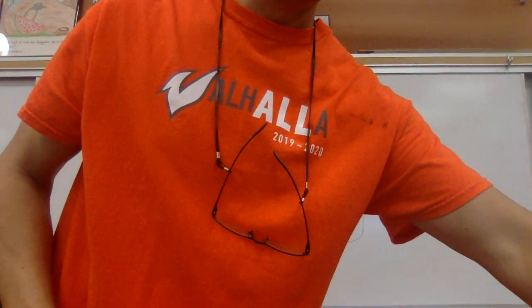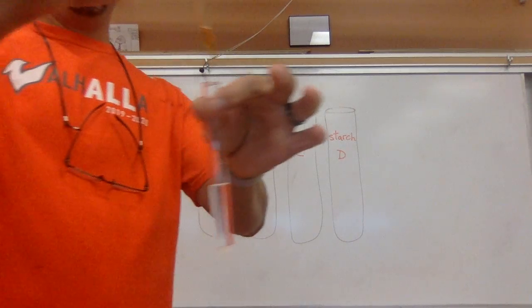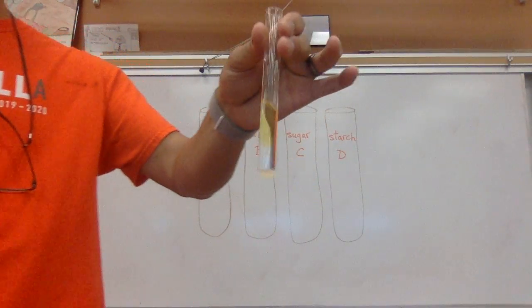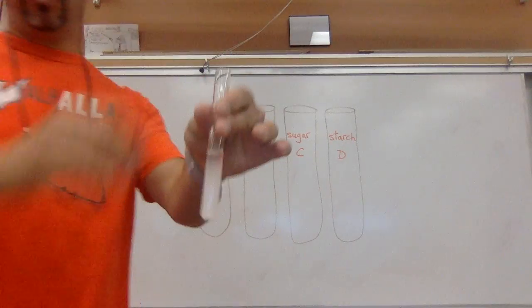All right, then we're going to go with the sugar. And again, same thing, right? You can see if you give it time, we mix it, it'll mix in, but no different, right? Same as the salt and the pure water. Now let's take a look at the cornstarch.